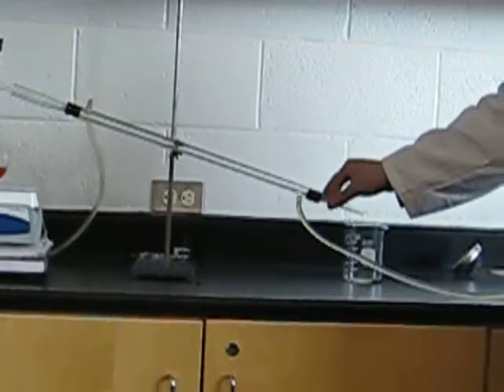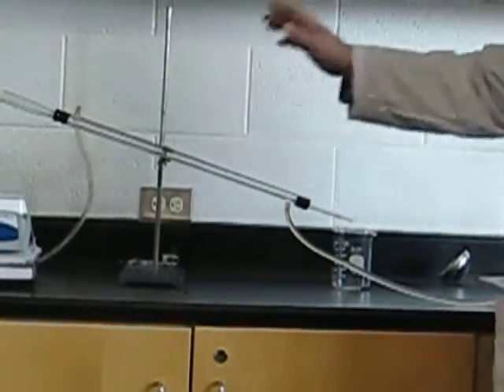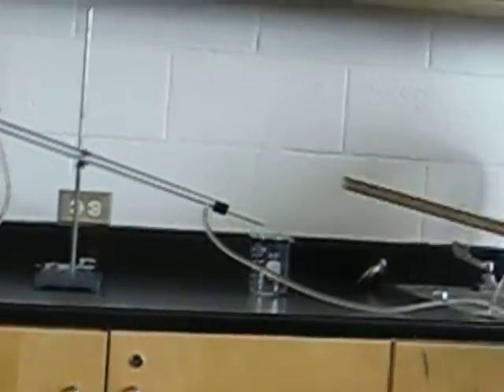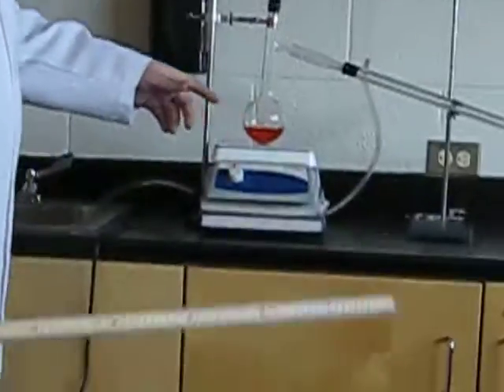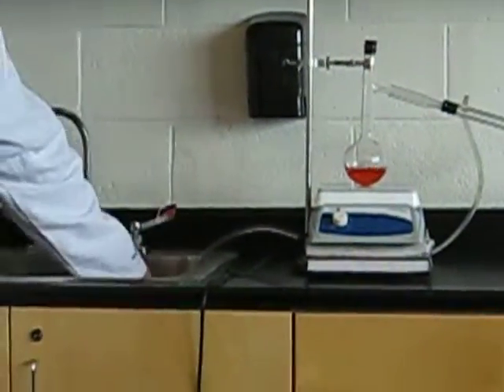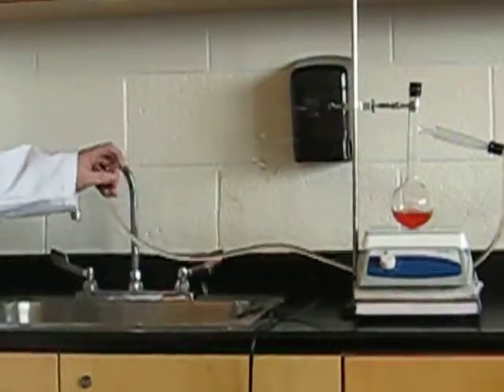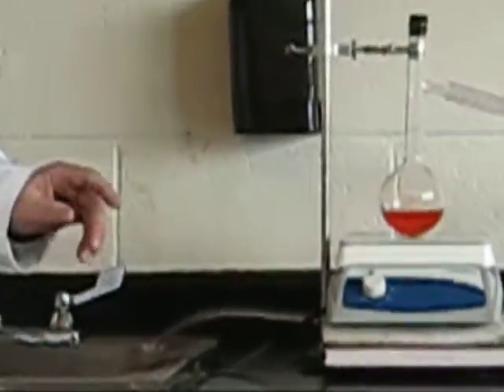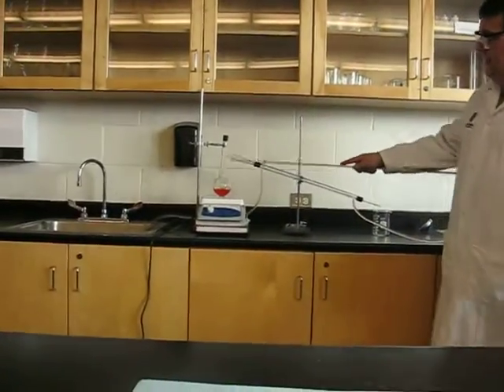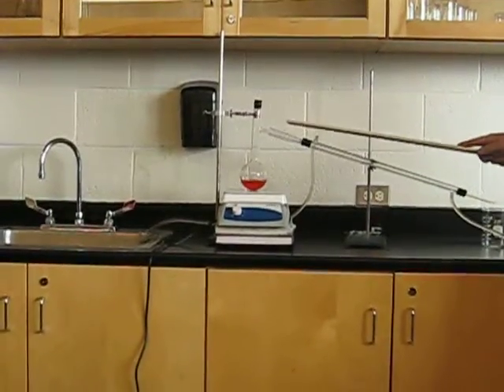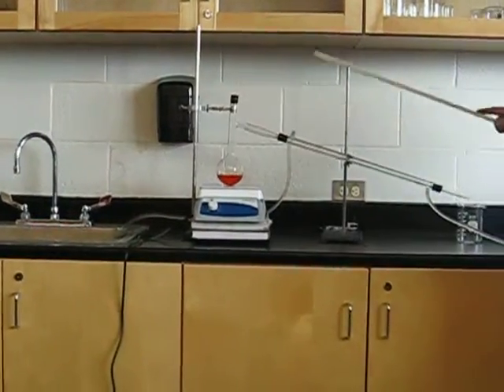Our condenser is a tube within a tube. Cold water enters through the intake and exits through the outtake into our sink. As it boils and turns into water vapor, it enters the condenser, and then it goes through a process of condensation.